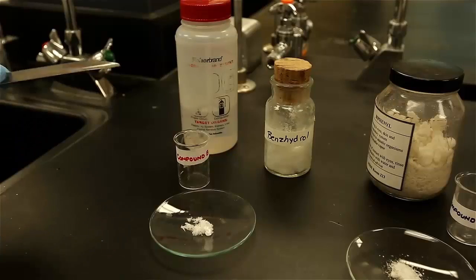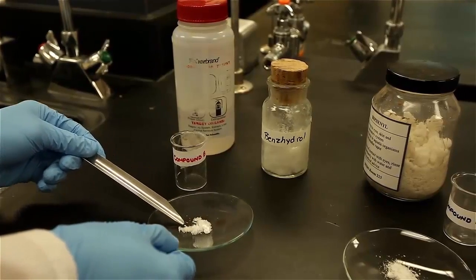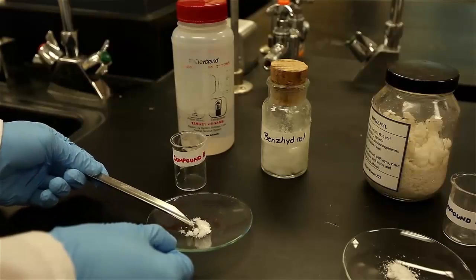When preparing your sample for spotting, you must first dissolve it in a solvent in order to dilute the concentration applied to the TLC plate. You must do this for both solids and liquid samples.